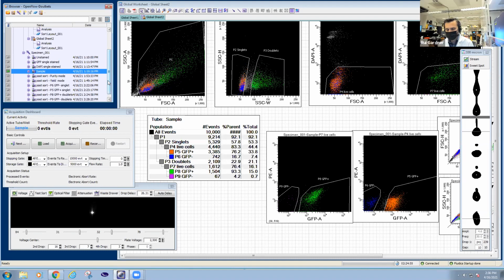You could have sorted 10 times as many cells. And I suppose this is the experience that you get from sorting, and this is where samples like this that are a little tricky are actually quite useful for us, I think, because it helps us understand a little bit more what we have to concentrate on and what we have to look for.